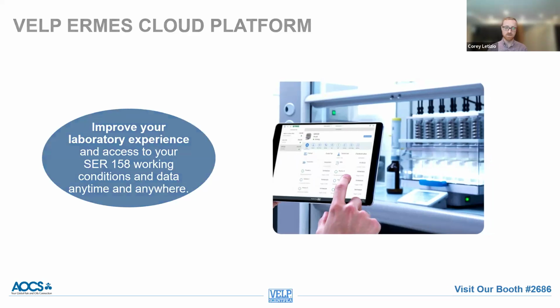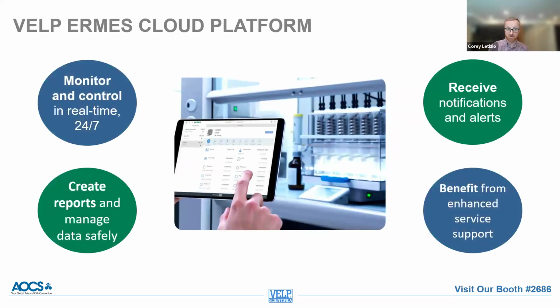Now, more about this system is you're able to monitor and control the system in real time, 24/7. You can create reports and manage your data through this. You'll receive notifications and alerts if anything is looking different on the instrument or you want to dive into it more. And you also benefit from enhanced service support. So, with this, our service team is actually able to remote into your instrument, providing us with the quickest turnaround time for service and support in that nature.